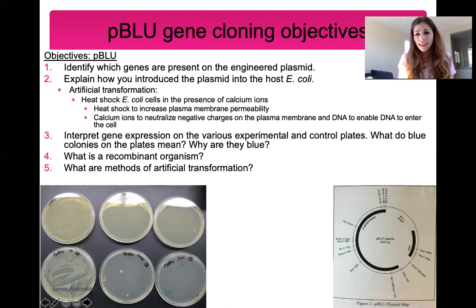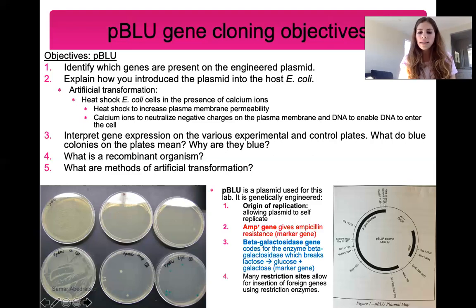I really wish we were doing this experiment in lab because this is one of my favorite experiments because it's so relevant to the biotech research world. And that's it. That's the end of this lab. So here's the pBLU plasmid, and I hope this makes somewhat of sense, even though you guys are not doing it. And I'll end it here.